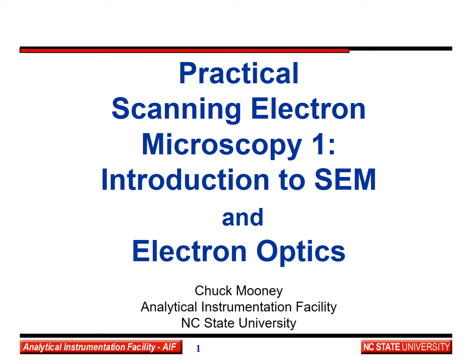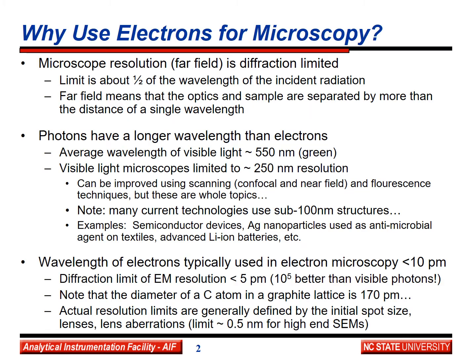My name is Chuck Mooney, and this is the first in my practical SEM lecture series, Introduction to SEM and Electron Optics. Why do we want to use electrons for microscopy to begin with?